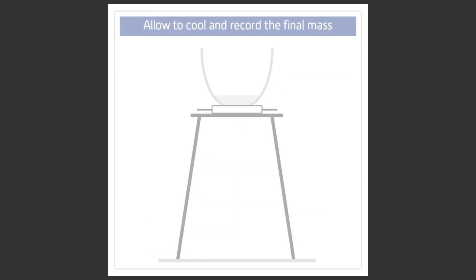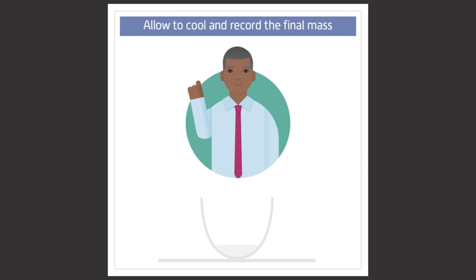Allow the equipment to fully cool and then record the final mass of the crucible. To speed up the cooling of the crucible, you can use tongs to carefully remove it from the tripod and place it on a heat proof mat. However, you should always listen to your teacher first, as they may prefer you to wait for it to cool before you handle it.